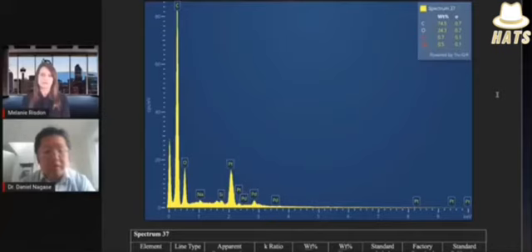So it might look like some type of salt crystal, but it's made up of purely carbon and oxygen and possibly hydrogen. We don't know how much hydrogen is in that sample because the detector can't detect the spectrum for hydrogen. So again, no signs of biologic material. Let's move on to the next Pfizer file.